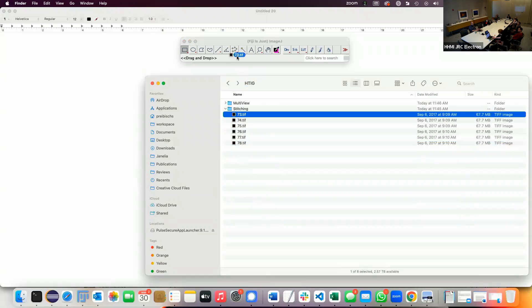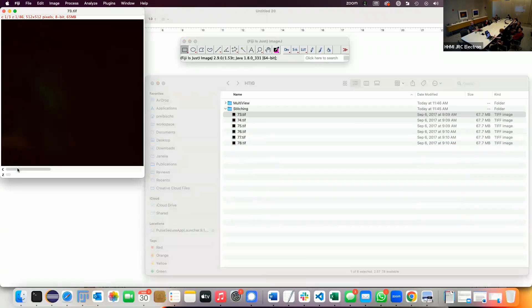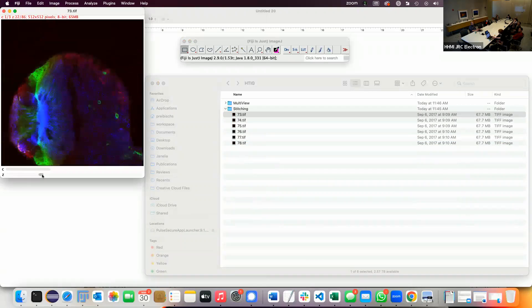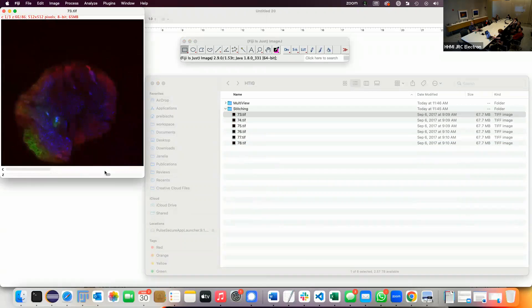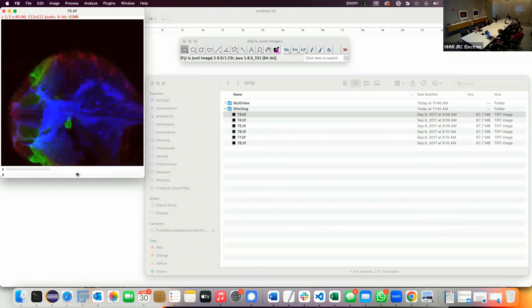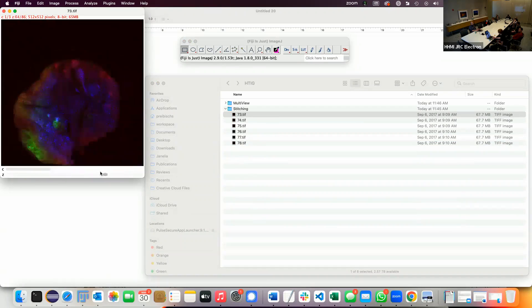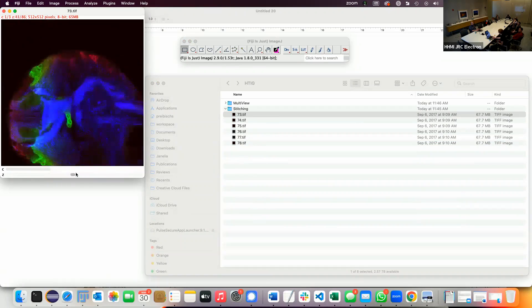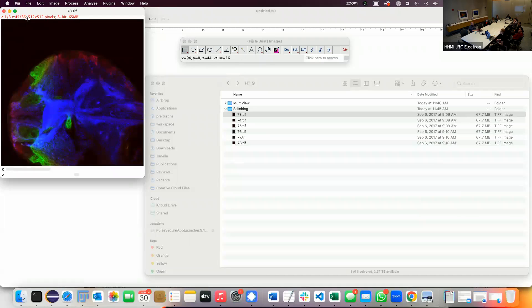I just opened one of those files. That's actually from Janelia — from Jim Truman's lab. These are Drosophila nervous systems, three-channel data, confocal. It's 512 by 512 by 60 slices — pretty small stacks. We have six of them that we want to put together. It's a nice simple example because everything is really quick, and the concept is the same for large datasets.